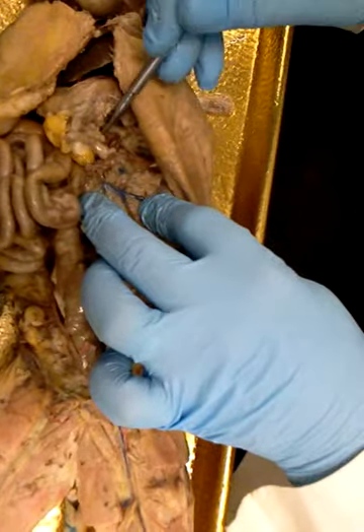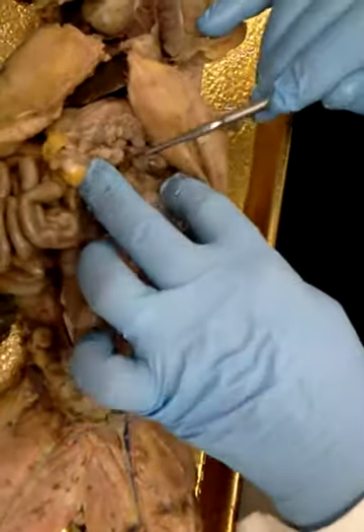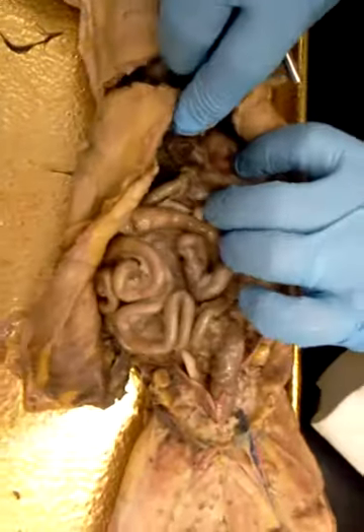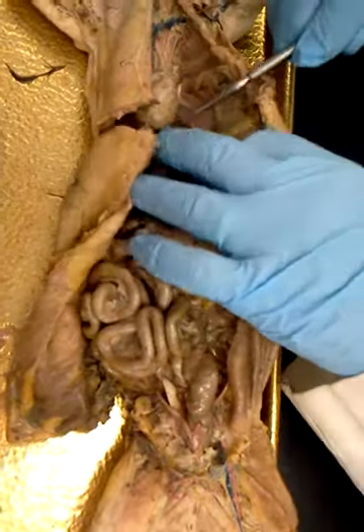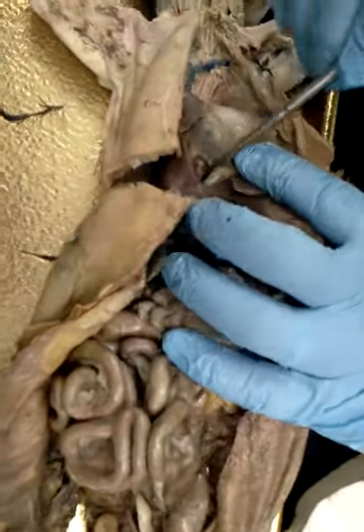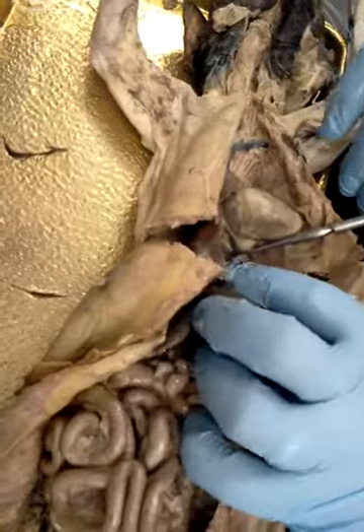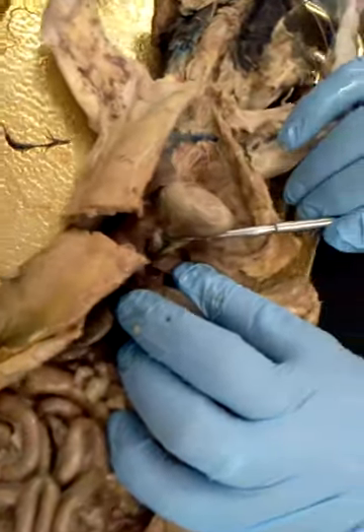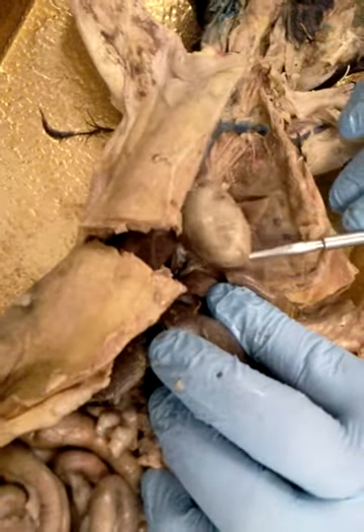Goes past the celiac trunk of the superior mesenteric, goes past the celiac trunk, goes underneath the liver, can't see it, and then comes up to the heart, right here, just behind the heart. There is the inferior vena cava, right there. Can you see that? Right there is the inferior vena cava, just underneath the heart.